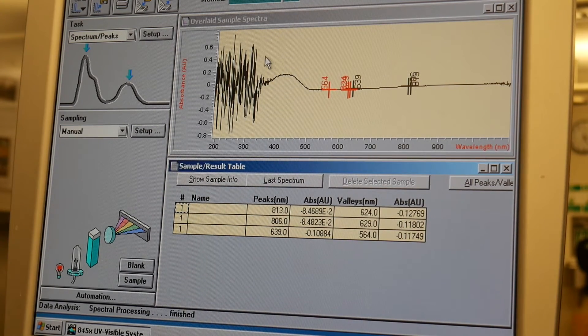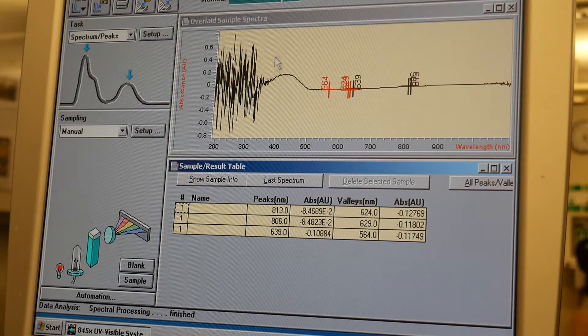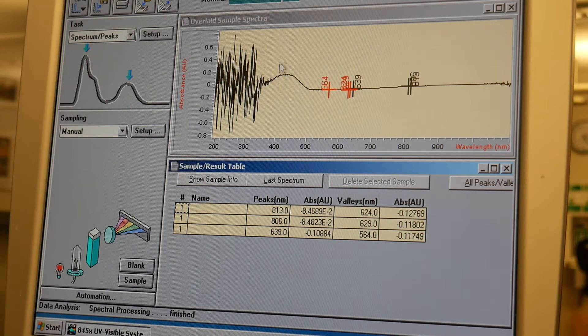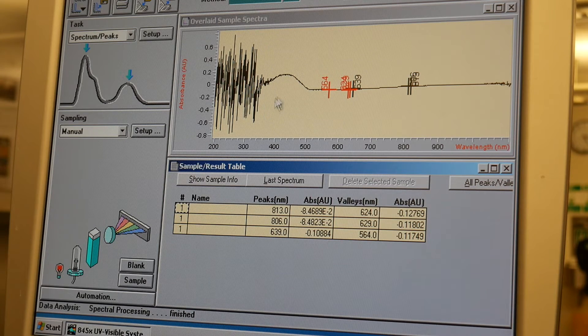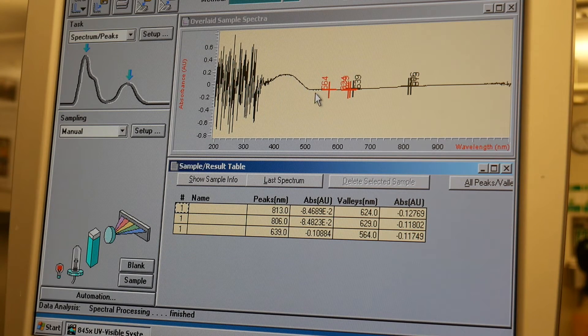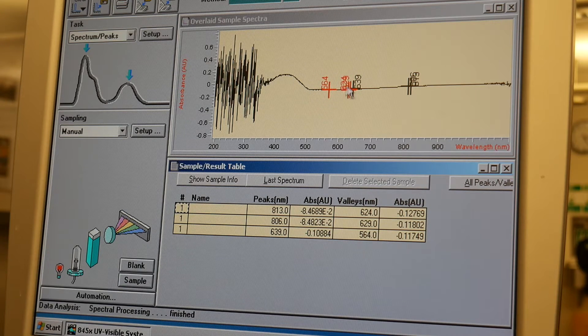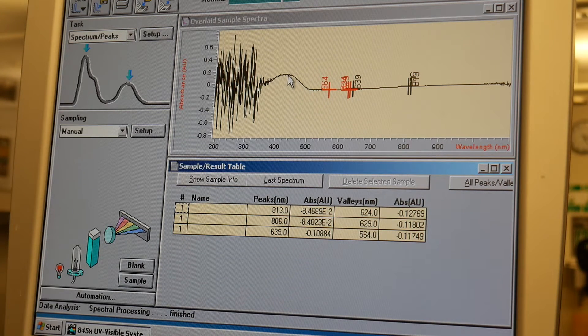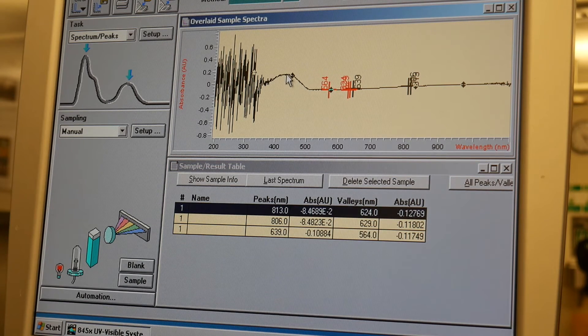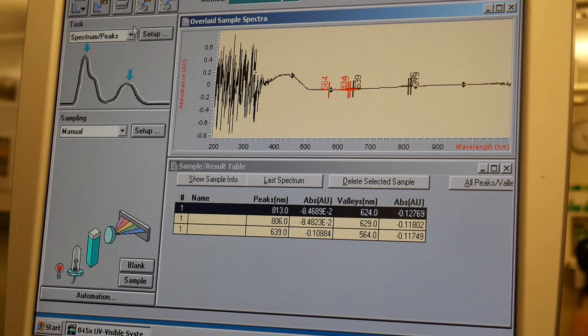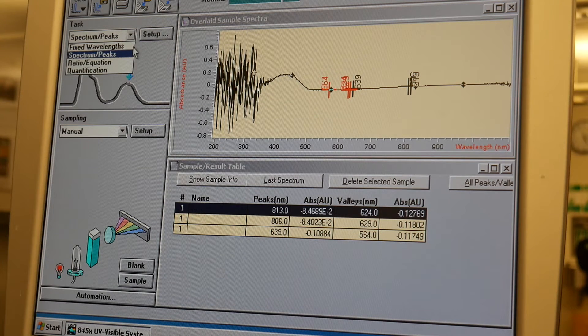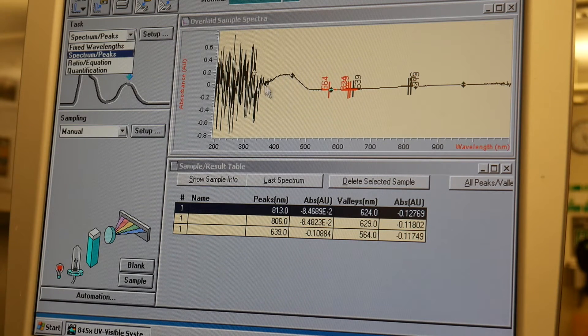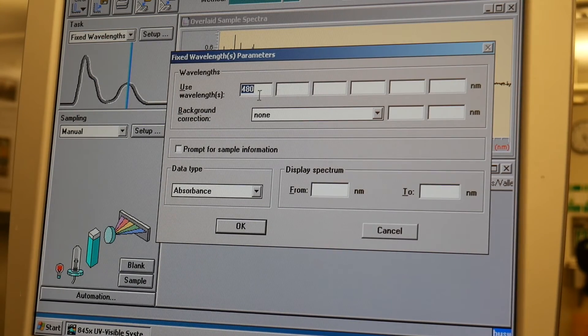Okay. So now if you look here, you can see there's kind of a mess right here where the UV spectrum starts. And then there is your peak. Now, the peak finder didn't do a good job of finding peaks. The real peak is right here at about 425. So what I can do is I can, if I want to see what the absorbance is in this range right here, maybe I can just go to the fixed wavelength thing.